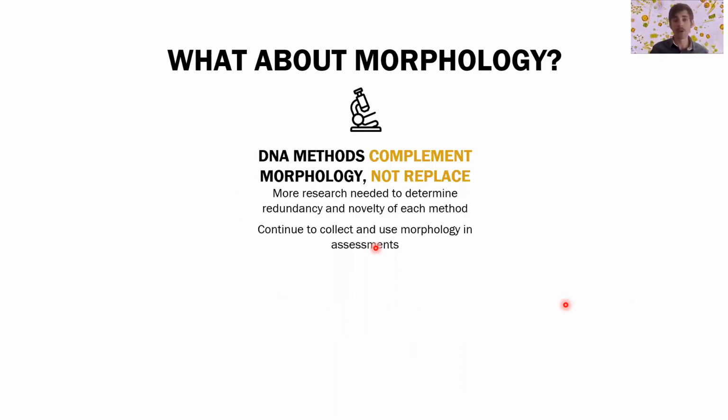Really quickly, I know many of you are probably wondering, what about morphology? I said that the methods complement each other, but they don't replace each other. More research is needed to determine the redundancy and novelty of each method. And for now, we need to continue to collect and use morphology in assessments until we understand the relationship between the two of those. There could be a point in the future where metabarcoding replaces morphology for assessments, but we're not there yet. And it's possible that we won't be there. It depends on the information that we're interested in and how much we trust each data source.